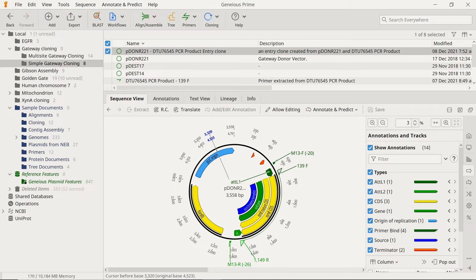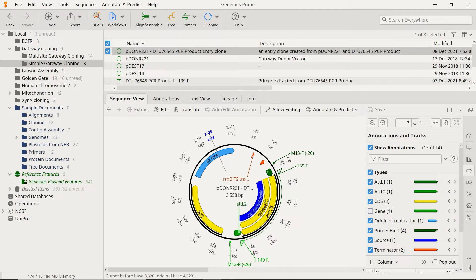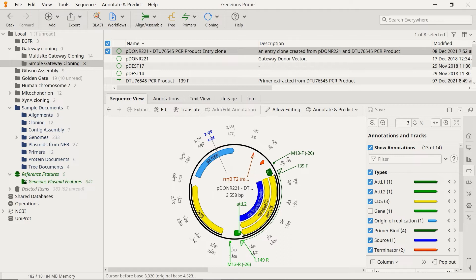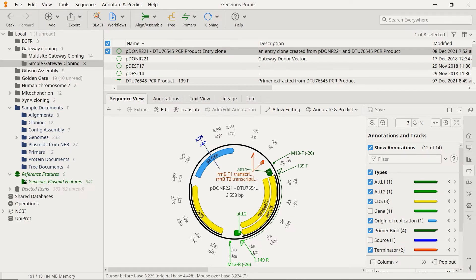Most donor vectors should contain a set of primer binding regions that flank the attL sites. For example, the pDONR221 vector contains the M13 forward and reverse primer binding regions, making them suitable targets for PCR.